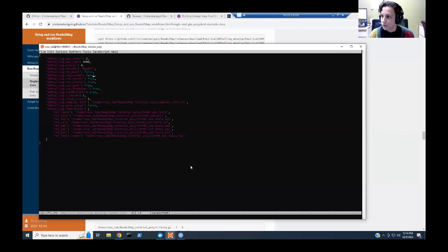I put false. And if I will run TASSEL, yes. If I will run Stacks, yes, again. If I will run GATK, yes. If I will run Freebayes, yes. And if I will perform the hard filters in GATK SNP calls, yes, I will. And how many chromosomes am I working with? I'm working with only one. That's chromosome 4. The chunk size, because Reads2Map will parallelize the analysis of the samples, and I need to know how many samples you want in each one of the batches that will be parallelized.